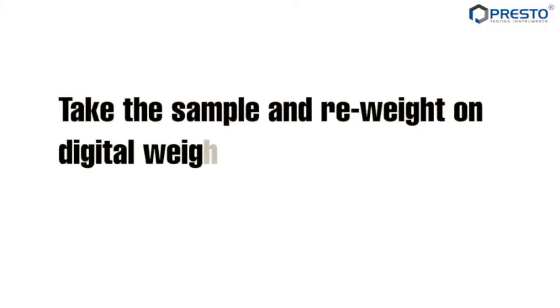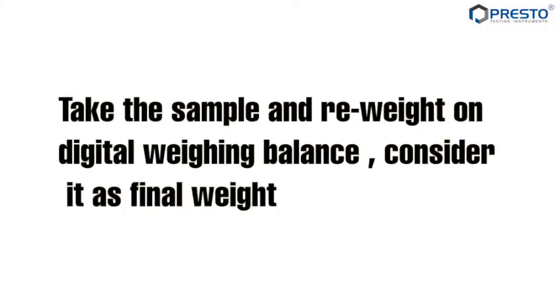Weigh the sample on a digital weighing balance and consider it as the final weight.